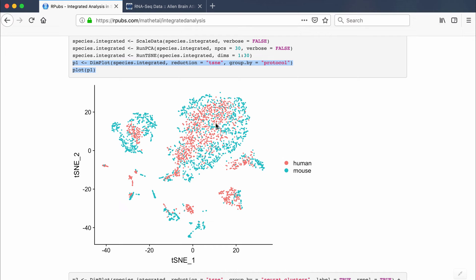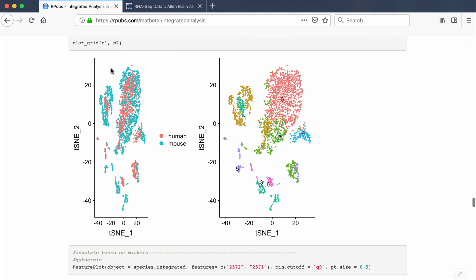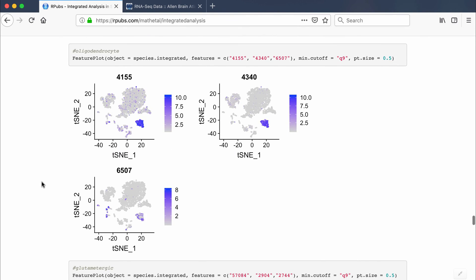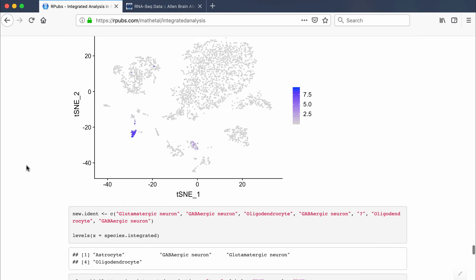The p1 plot shows the integrated object separated by species or protocol. After running the analysis, you can also run the p2 code, which shows the integrated object separated by Seurat clusters. The next code shows the two t-SNE plots side by side — one separated by species and one by Seurat clusters. In the next part of the code I show examples of cluster cell type labeling using genetic markers and feature plots.